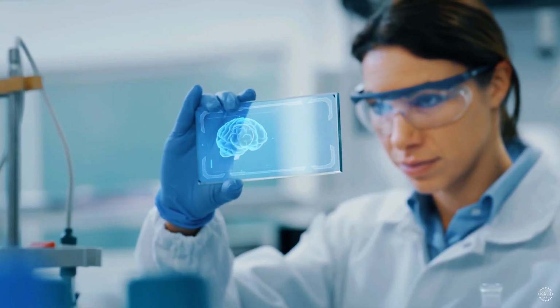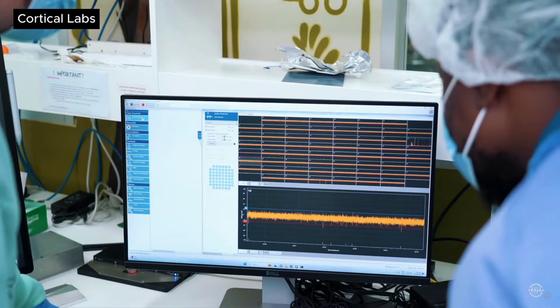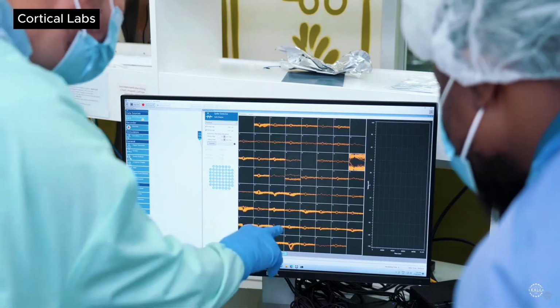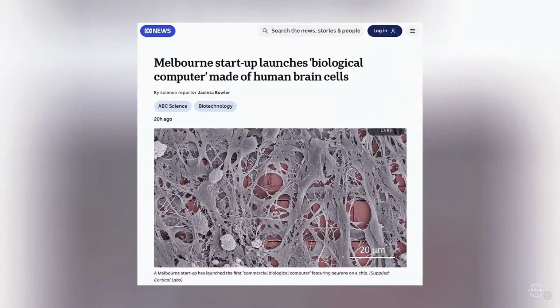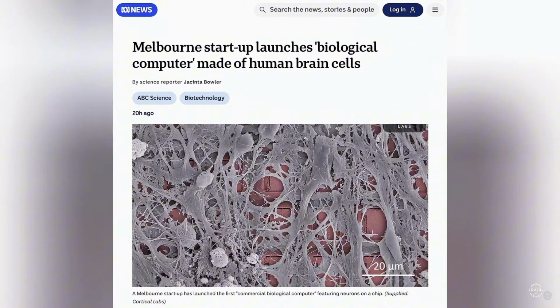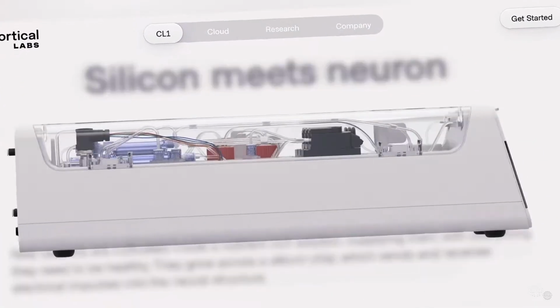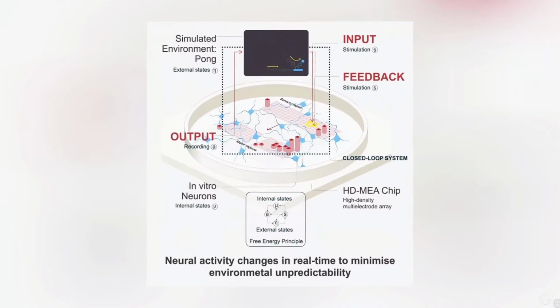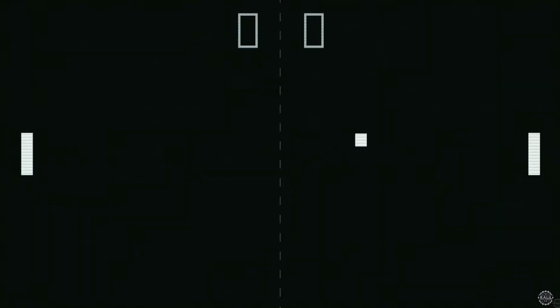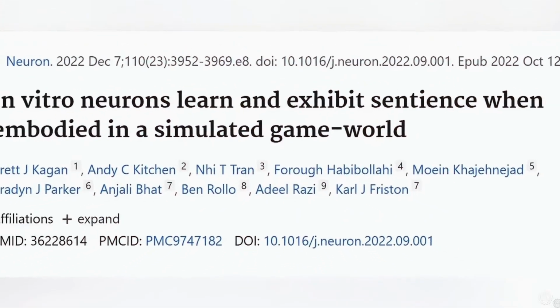At the core of the CL1 are lab-grown neurons placed on a planar electrode array, a simple yet effective setup of metal and glass containing 59 electrodes. This creates a stable network, giving scientists fine control over neuron activity. The system is housed in a life support unit that Kagan compares to a body in a box. It includes advanced systems for filtration, liquid storage, gas mixing, circulation, and temperature control, ensuring the neurons remain healthy and responsive.